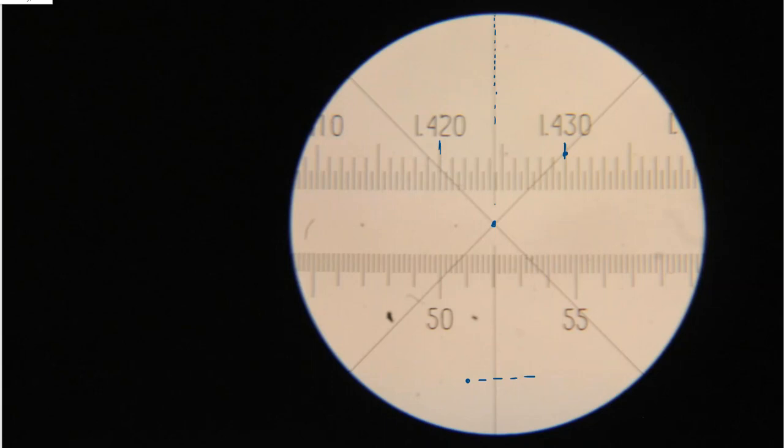There should be no excuse that we shouldn't do this test whenever needed, because everything is convenient, everything's super quick, and it's a very easy method to master. So here is the refractive index for my unknown, and this is clue number 1. Imagine that you're playing Clue, the game. Do you remember that board game? I do. Maybe I'm showing my age, but here's clue 1. Now we need 2 more clues in order to figure out who did it.